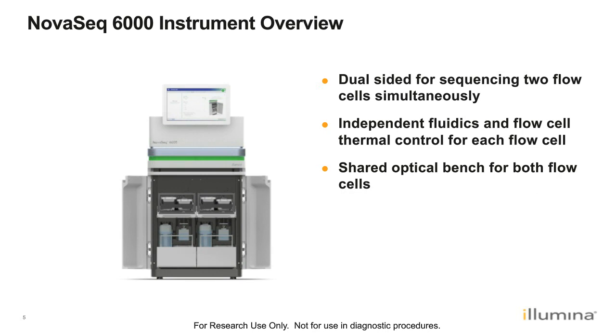Apart from the buffer cartridge, we also have 2 different containers to catch the spent reagents. The larger container houses all of the non-hazardous materials, while the smaller one houses the formamide. We'll discuss these in a little bit more detail in the maintenance section. We have also built in a second method of spent reagent collection for high throughput labs, where the back of the instrument has connector points where it can be hooked up directly to a large waste drum.